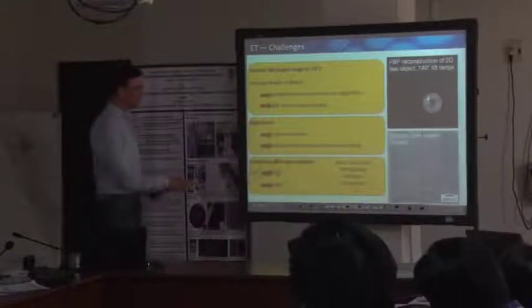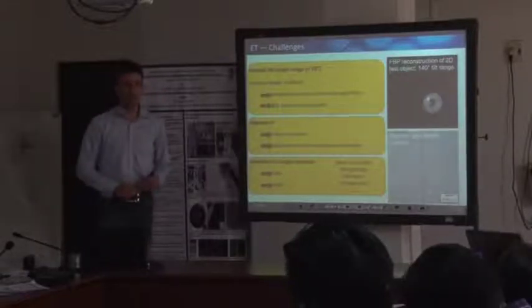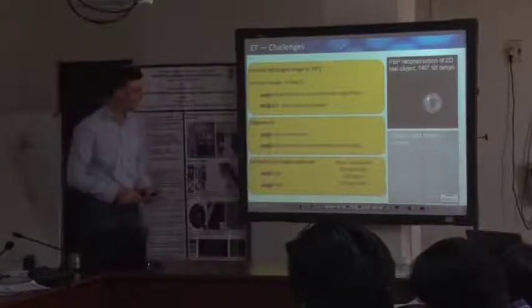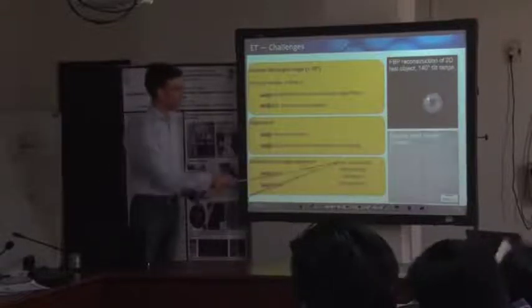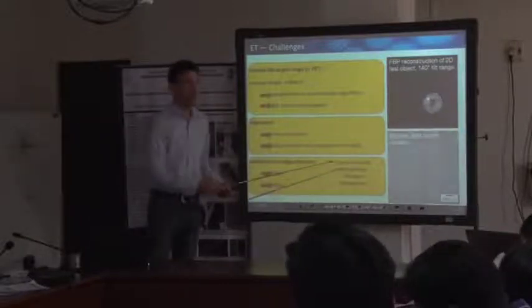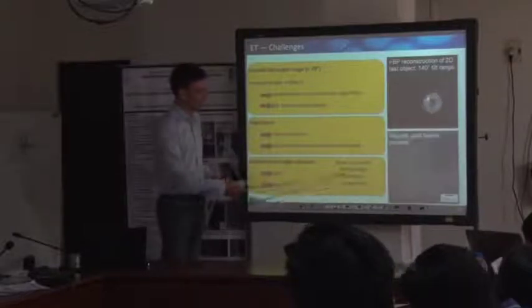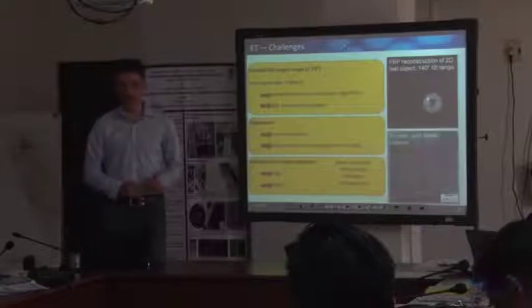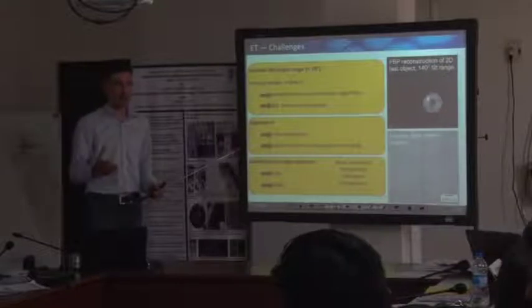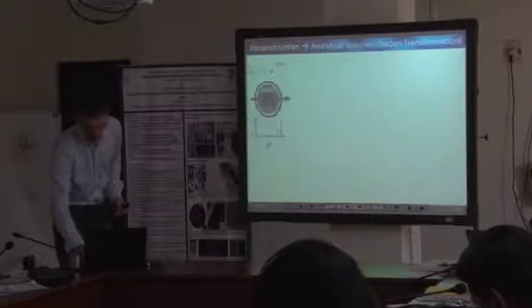And for sure, you have to think about your contrast mechanism, so the best illumination and imaging conditions for a specific purpose, specific material and question. And this is related to beam sensitivity, because some materials, like organic materials, are far more stable under a parallel electron beam. It depends on the features that you're interested in as well, and the sample thickness, and in principle it depends on the field of view that you want to cover in the sample.